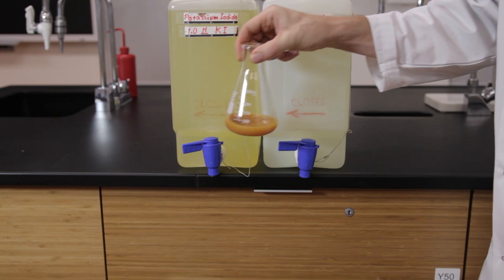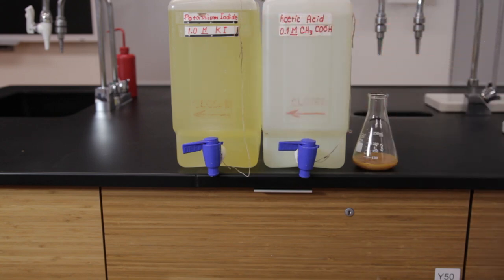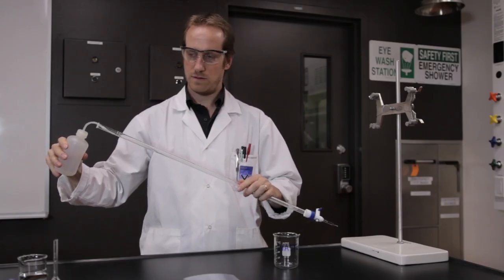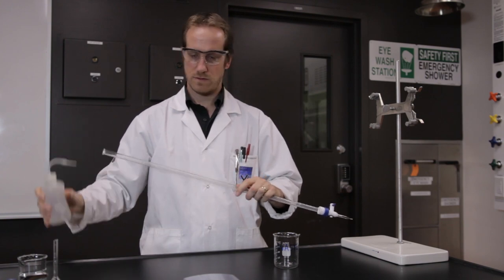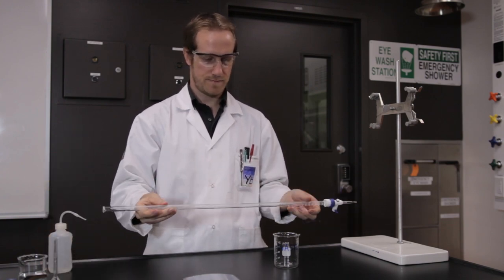While you're preparing the titration samples, your partner can prepare the burette. Wash a burette with soap and rinse it thoroughly with distilled water. Remember to wash the tip as well.